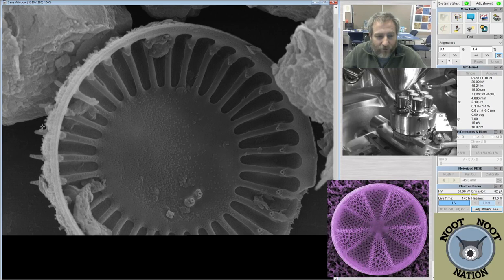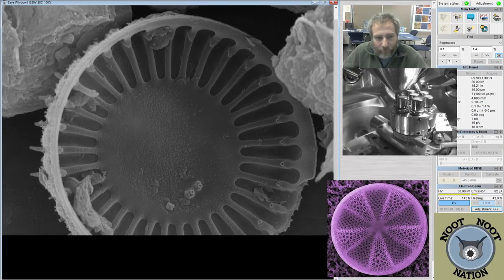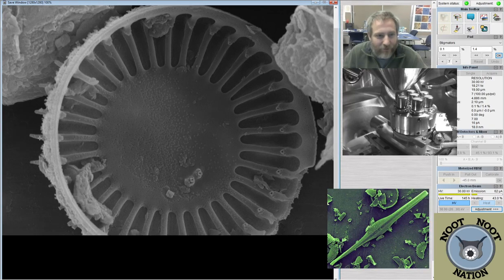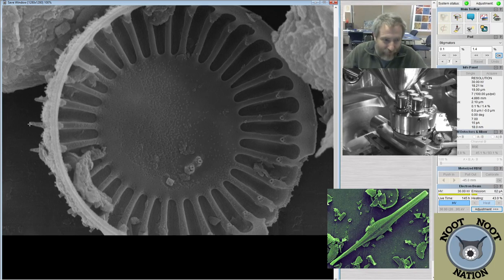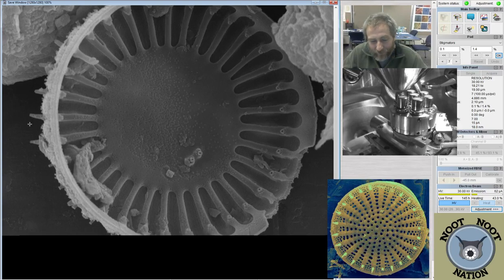In theory, they're supposed to be something that would protect the diatom, but it's pretty questionable to me how this little spine makes it significantly bigger, especially when there's a whole bunch of the same species that are much smaller than this and still have the spines. So, how does that help? It's not clear.